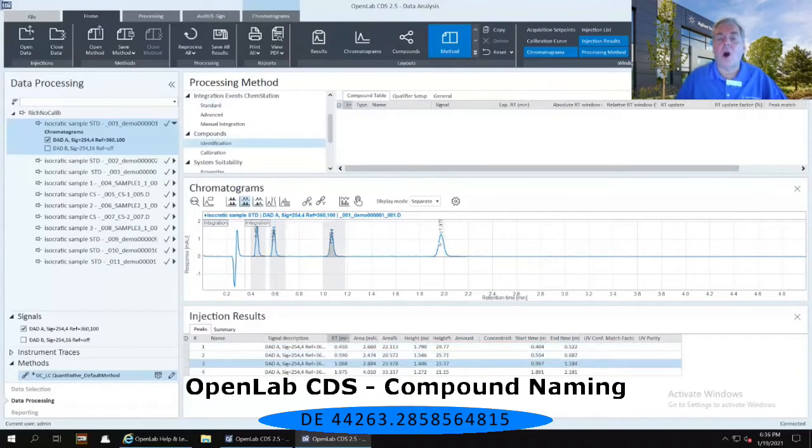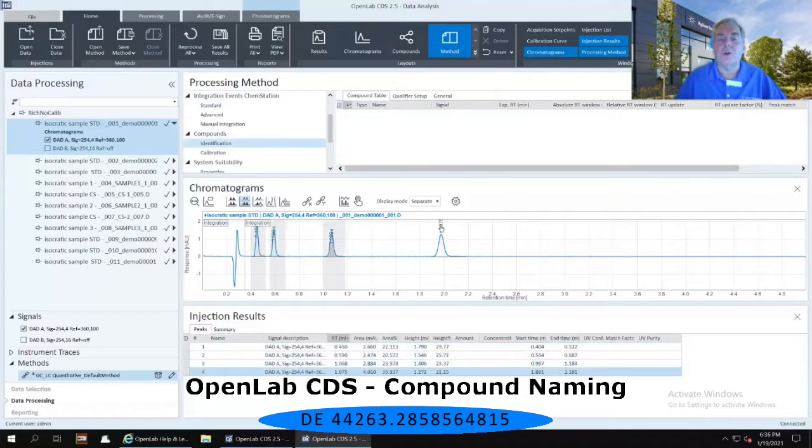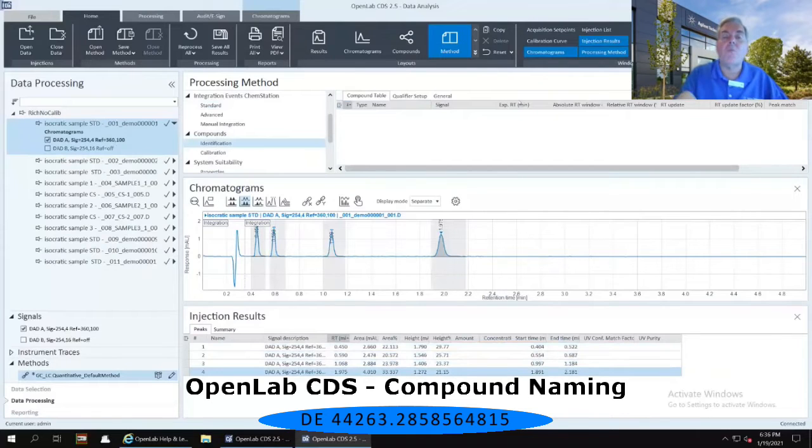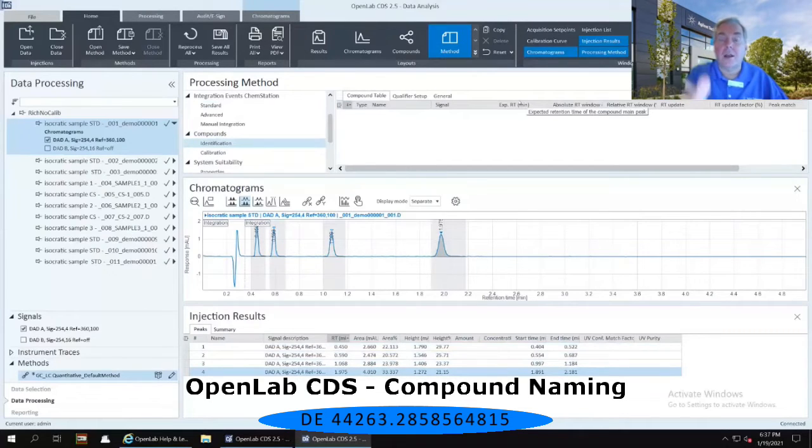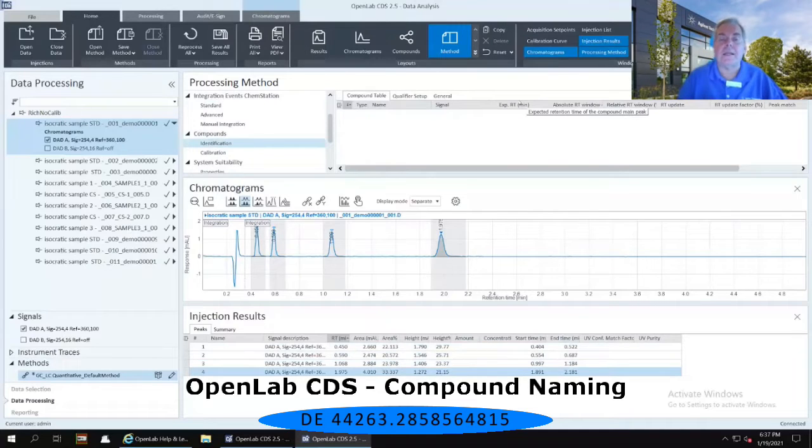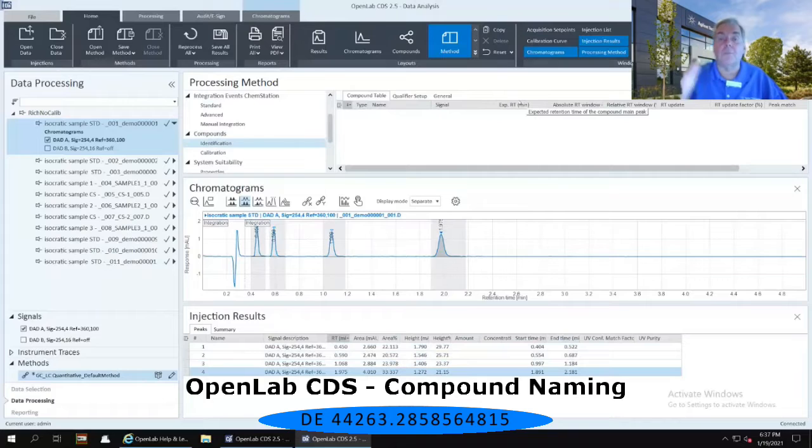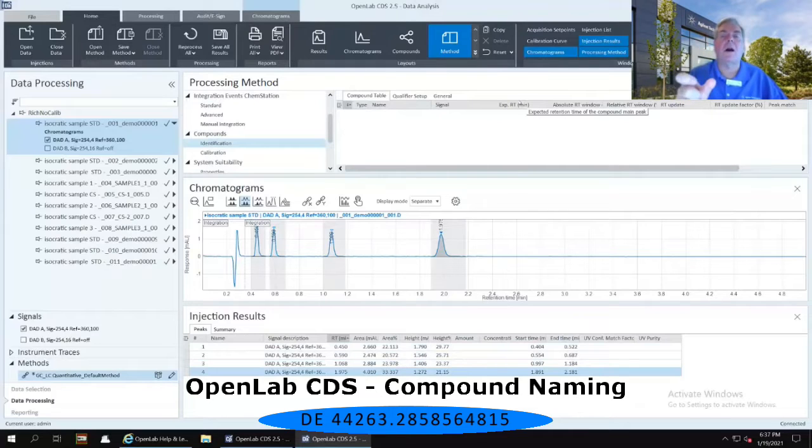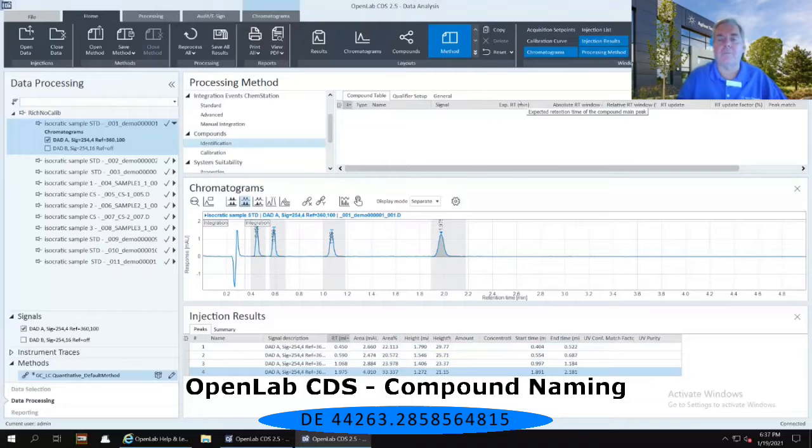And now all of those will have gray windows and gray columns associated with each one of those peaks. So now I have four columns corresponding to my four peaks in my chromatogram.